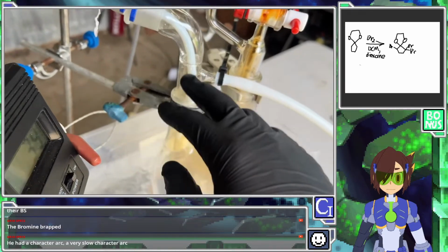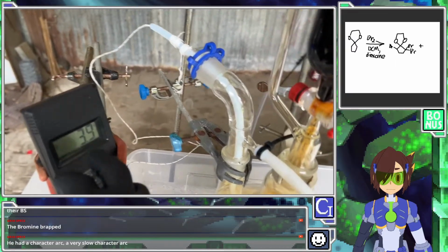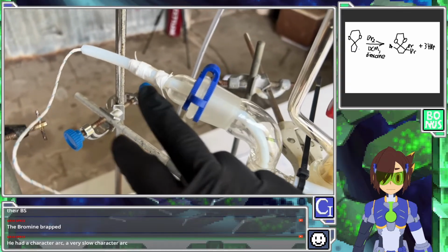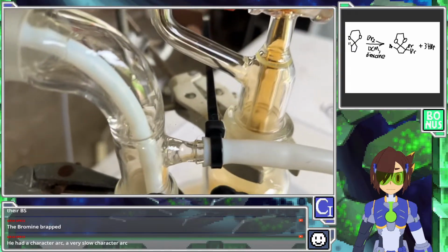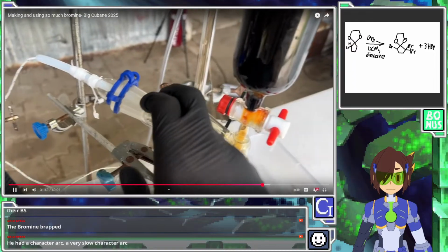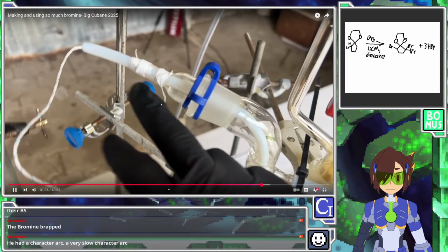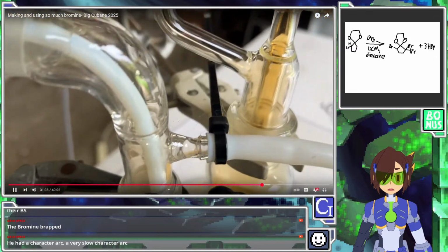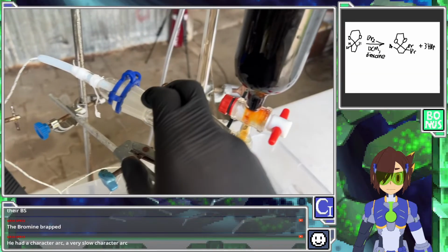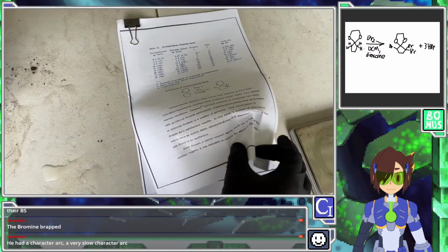Obviously, I could just use an actual thermometer and do this a little bit differently, but I like having the thing here for the camera, so it's sealed with this Teflon tape, which is a bit sketchy, but anyway, and through this bit of broken glassware in here. It's just fine. I've got a sort of sick perversion to have broken glassware somewhere. Didn't want to clean it.